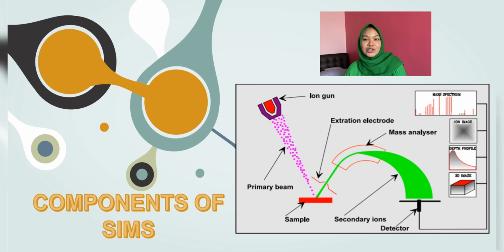The advantage of this configuration is that the electrostatic filter reduces the energy range of the secondary ions so that they can be separated into independent ion beams by passing them through a magnetic field.